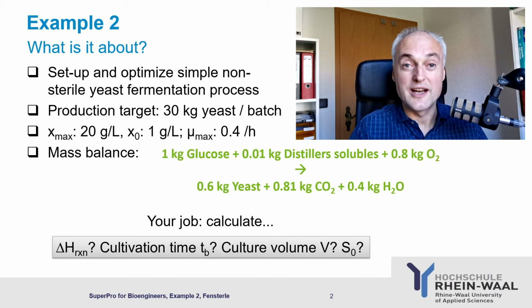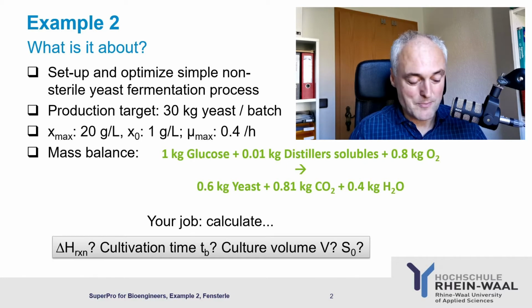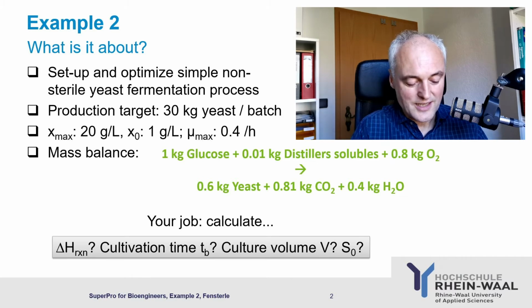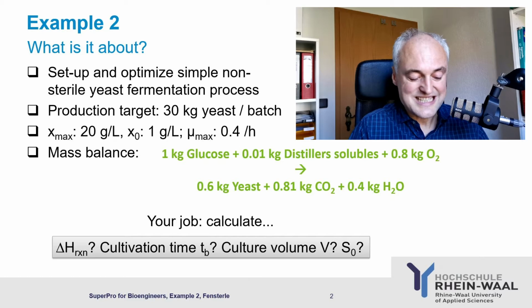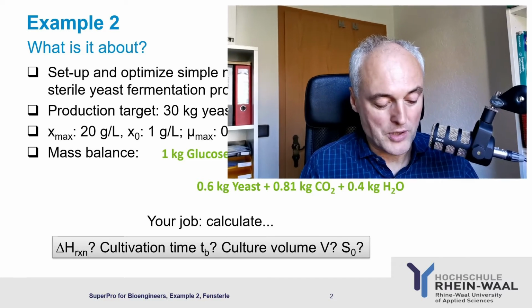And we don't care at that point about sterility, which is of course certainly a good idea if we set up a bioprocess. The intention here is setting up the fermentation process, but also scheduling of the upstream and downstream processes, the debottlenecking, and process optimization.